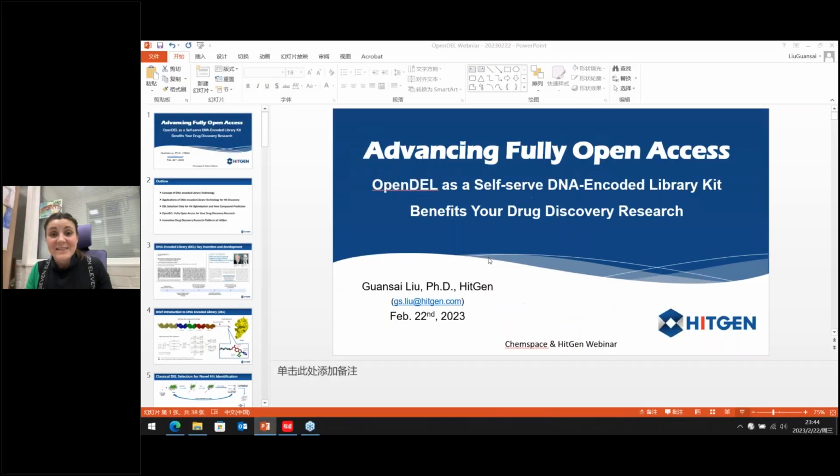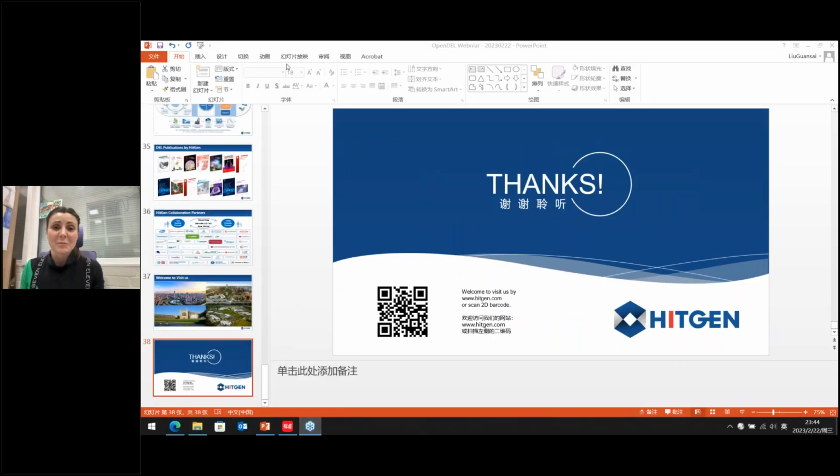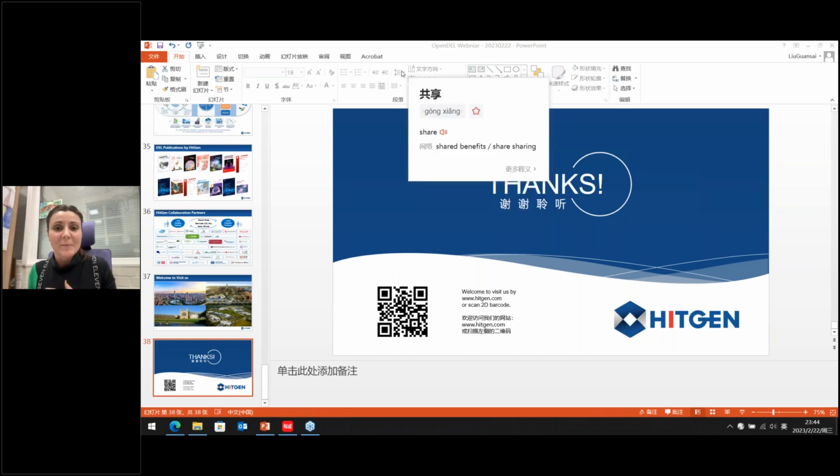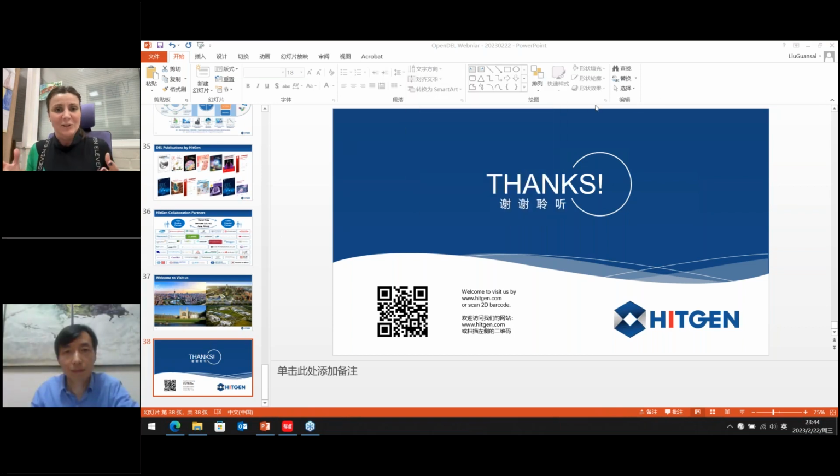Olga? Yeah. Thank you very much for such a great talk. Personally, I am a big fan of OpenDEL, of this product, because it's such a great idea to make such a complicated technology available and accessible literally for everyone. With a small budget and a target, you can perform a DEL screen and have the results.